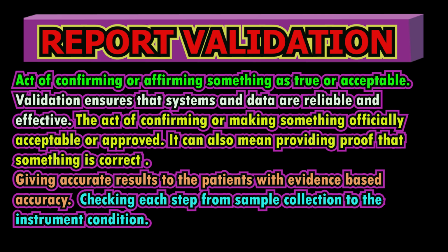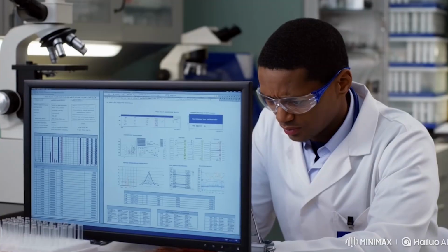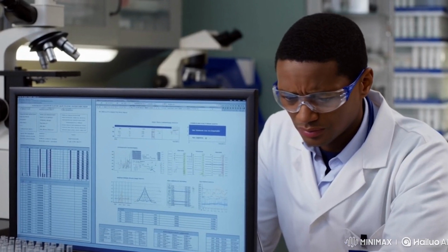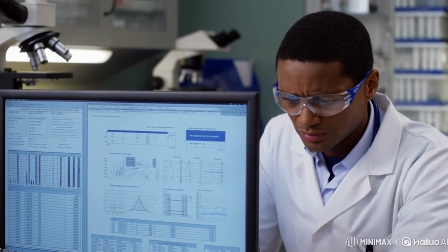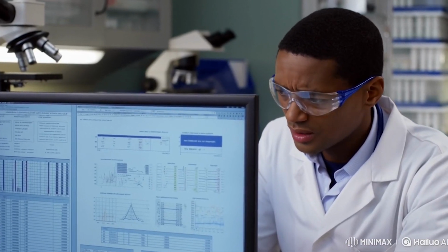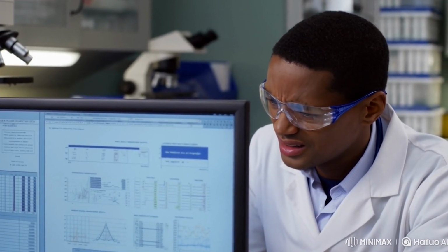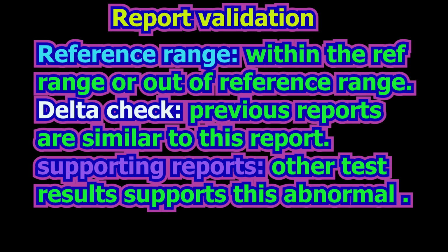In this video, we will discuss report validation. Many of you have issues in releasing the results to the patient when the results are ready from the instrument. When the results are within the reference range, they are reported immediately. But when the results are out of reference range, the technologists are responsible to report these results. This video explains each step to check the abnormal results and release the accurate results.